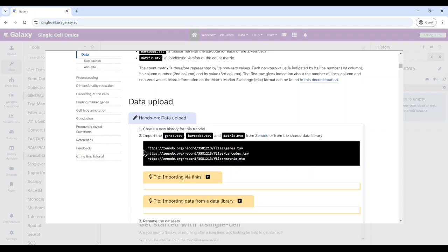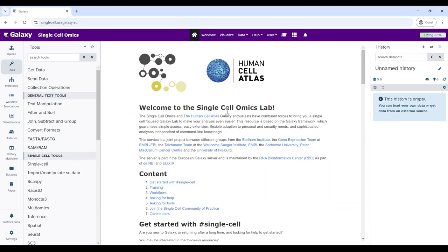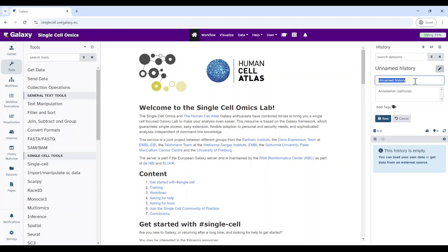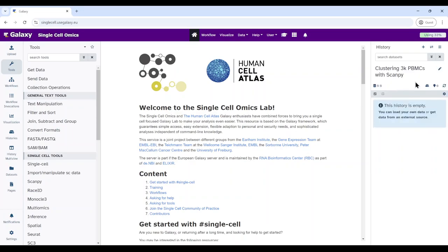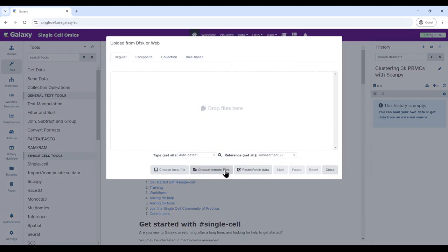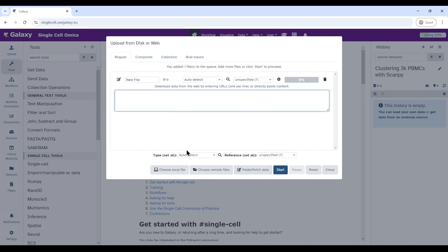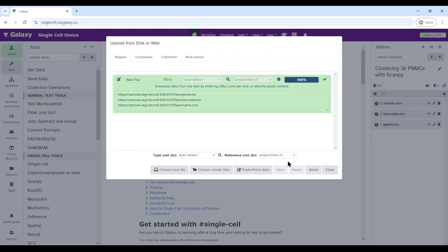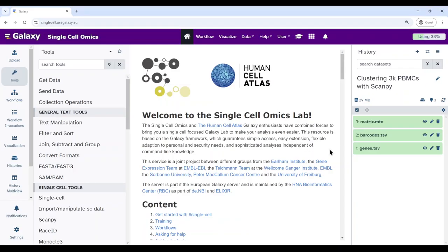We get the data from Zenodo into Galaxy. First copy the links and then click outside the window to re-enter Galaxy. Create a new history and rename it — for example, 'clustering 3K PBMCs with ScanPy'. Then go to paste or fetch, paste the links, and start uploading. Wait for a few seconds or maybe a minute and then it will be ready.